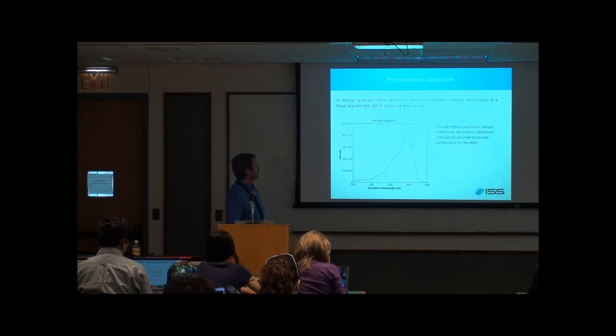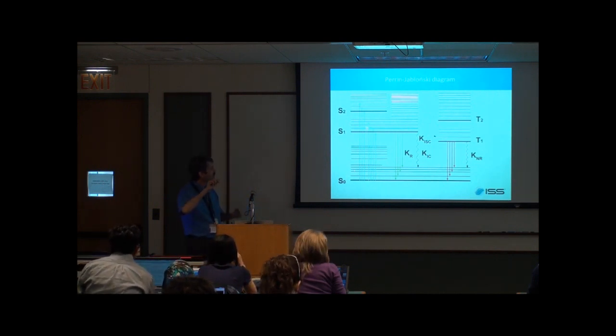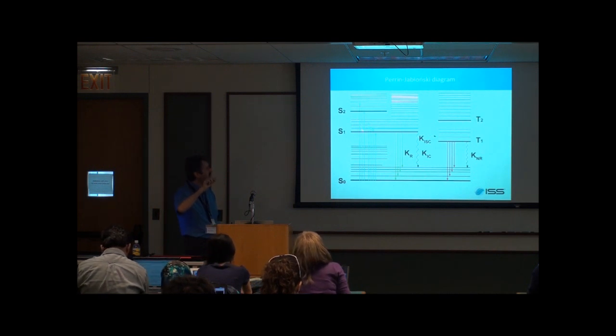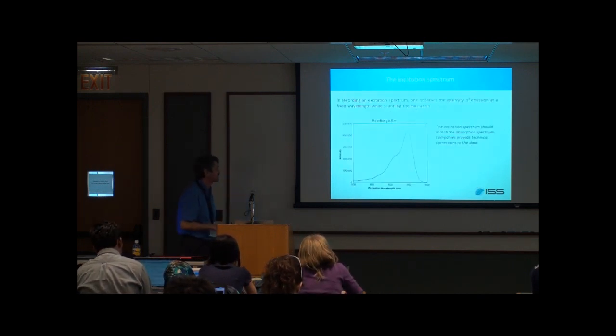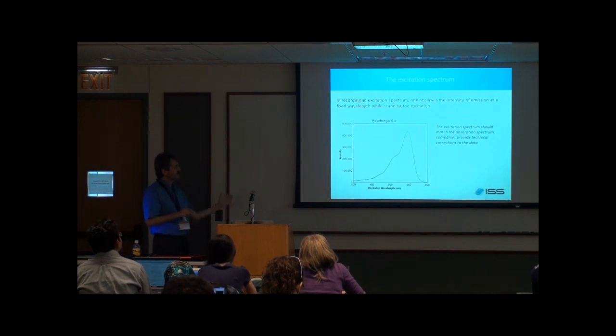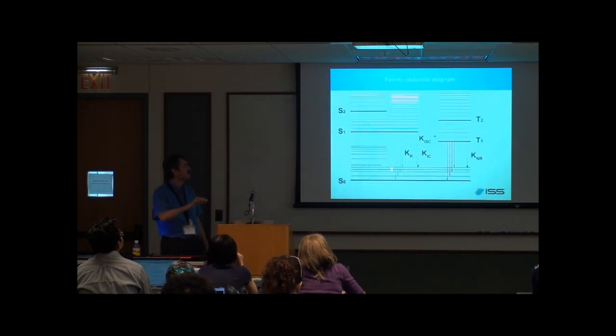Now, let's talk about an excitation spectrum. What happens with the excitation spectrum? To record an excitation spectrum, we want to see what is the range of frequencies, wavelengths or energies that a molecule absorbs. So in a spectrofluorometer, we position the instrument at a certain emission wavelength that we pick, and we vary the wavelength of the excitation, and we record the intensity of the emission.